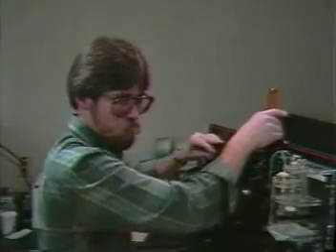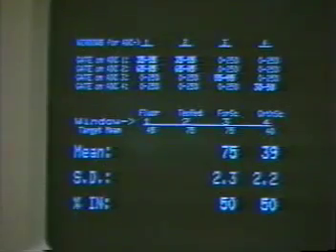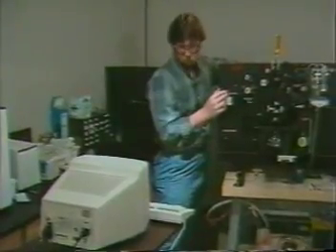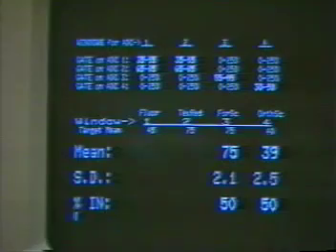To fine-tune, he calls up the FACS calibration routine by typing the word calibrite on the terminal keyboard. The calibrite display reads out mean signal levels for single beads on each FACS channel. When the mean value generated by a channel is close enough to the target value for the beads Keith is using, the column of figures for that channel will appear doubly bright on the screen, thus indicating that the channel is adjusted to standard.